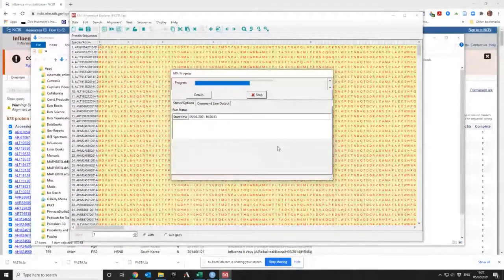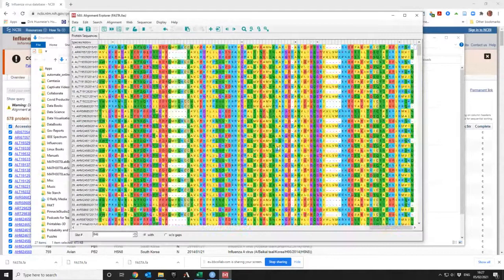I was going, oh. Now, ClustalW is definitely the worst of the alignment programs that still exists. They had a replacement to ClustalW, which is Clustal Omega. So if you're going to use a Clustal, you use that.